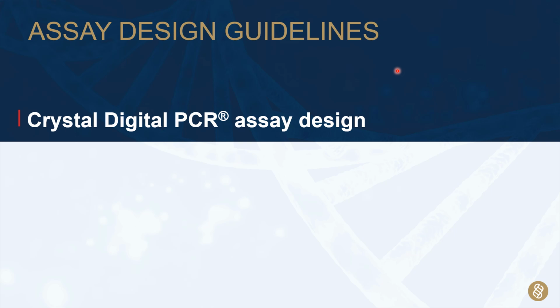Let's follow on to Crystal Digital PCR assay design. What are the considerations that we need to take into account when designing assays for Crystal Digital PCR?